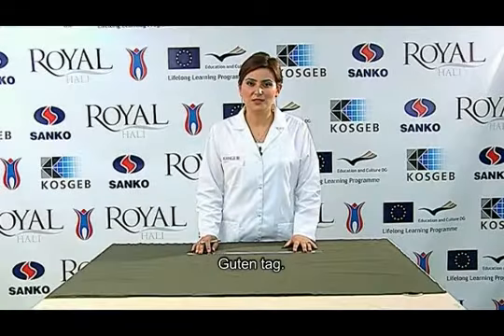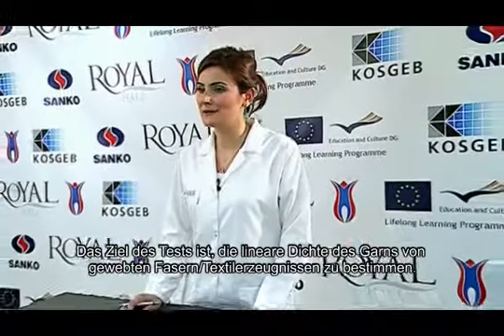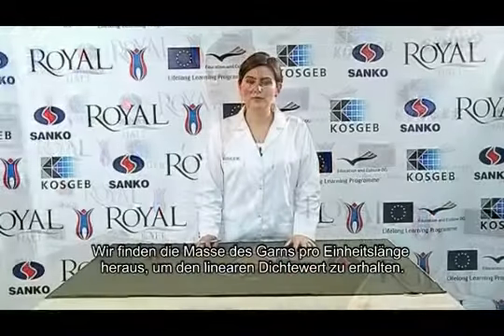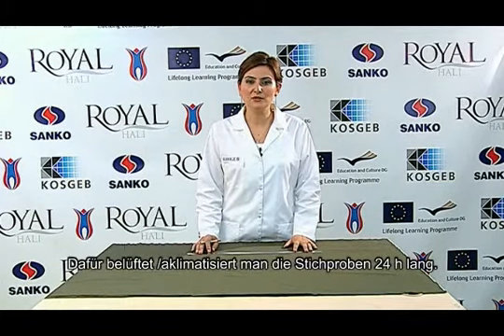Hi friends! The aim of the test is to determine the linear density of the yarn taken from the woven fabric. We will find the yarn's mass per unit length in order to obtain its linear density value. For this, we condition our sample for 24 hours.